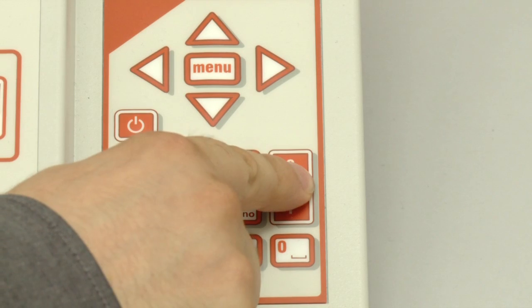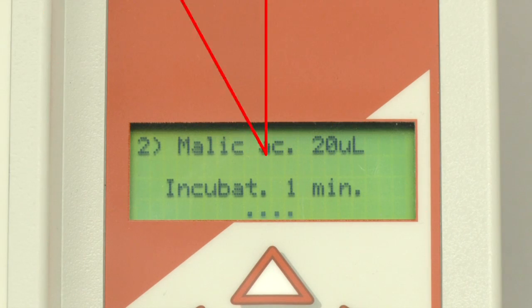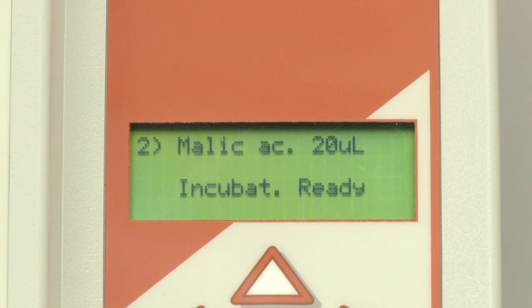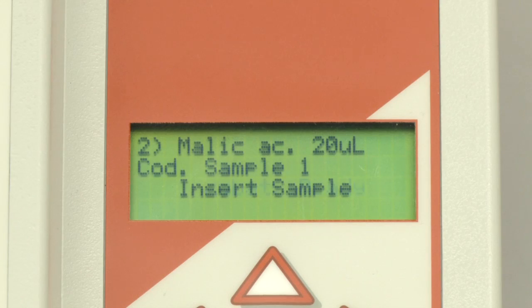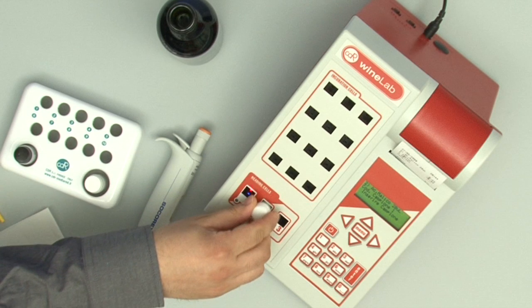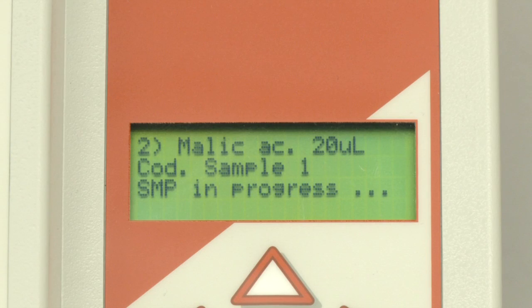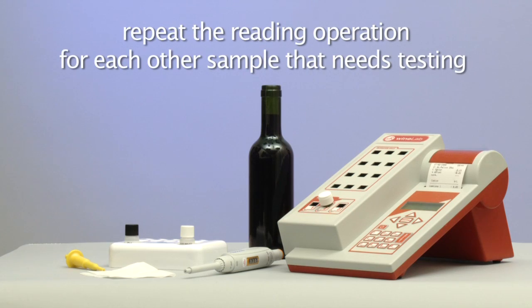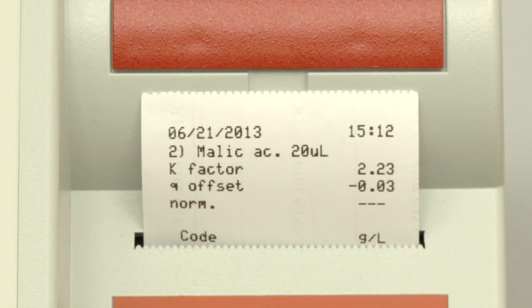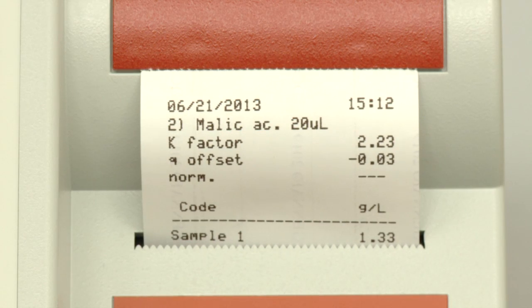Gently shake the test tube three to four times by inversion and place it again in the incubation cell. Repeat the operation of adding R2 for each other sample that needs testing. Then press Enter to start the incubation. Upon completion of incubation, press Enter. Insert sample displays. Place the test tube in the reading cell marked with the green light and press Enter to perform the reading. Repeat the reading operation for each other sample that needs testing. At the end of the reading session, the test results are printed.